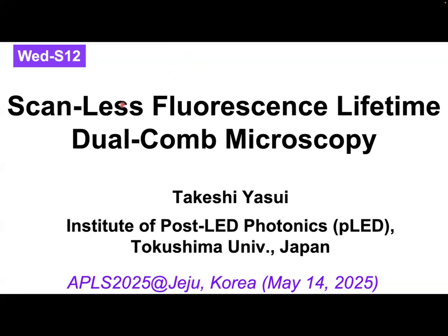Okay, so let's start my talk. We give a talk on the application of optical frequency comb for fluorescence microscopy, featuring scanless fluorescence lifetime imaging.